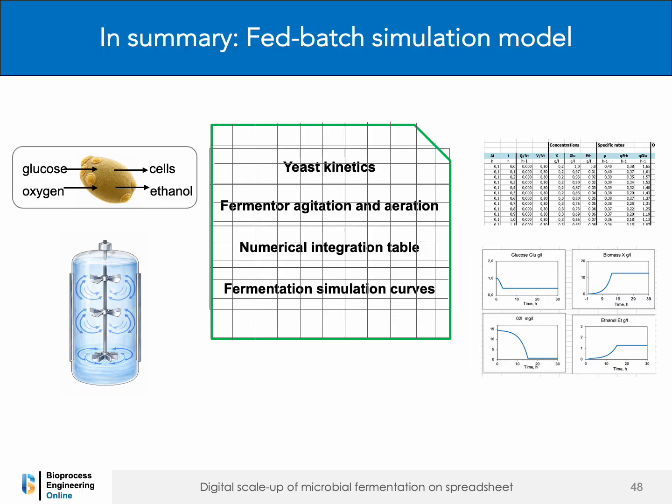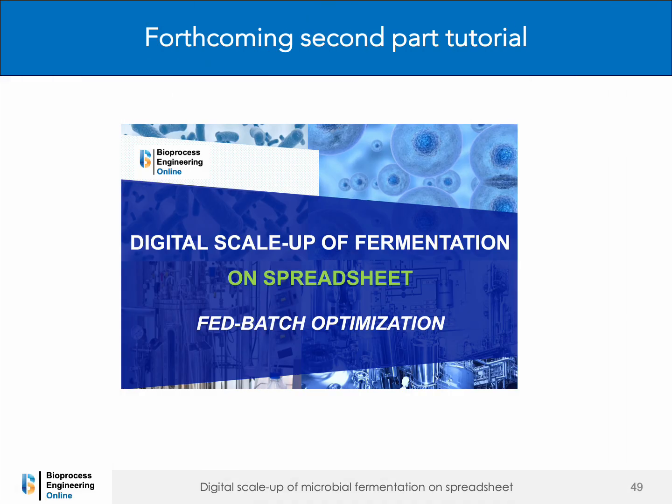The construction of this simulation model represents the first step in the digital scale-up of a yeast-fed batch fermentation. In a forthcoming tutorial, we will cover the second stage of the digital scale-up strategy, using the simulation model to optimize the fed batch fermentation process.